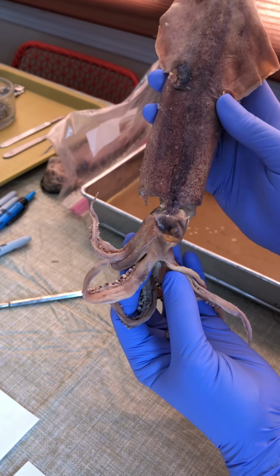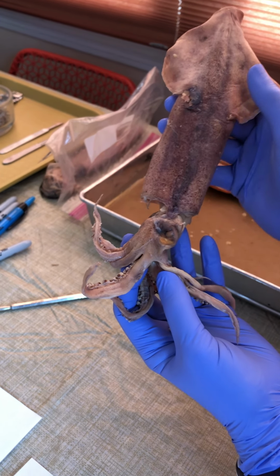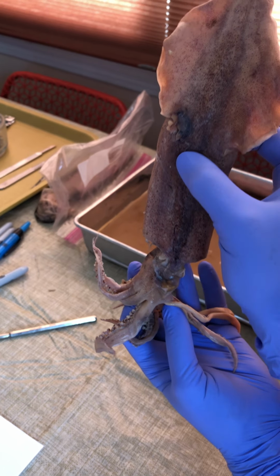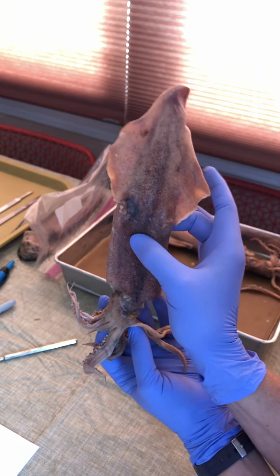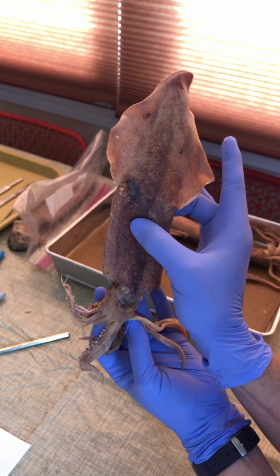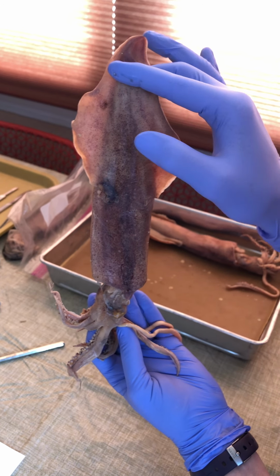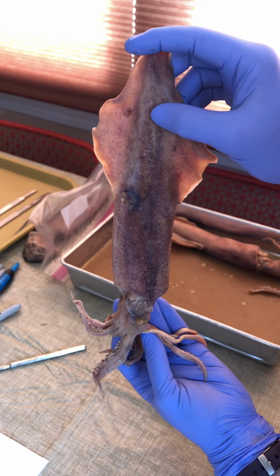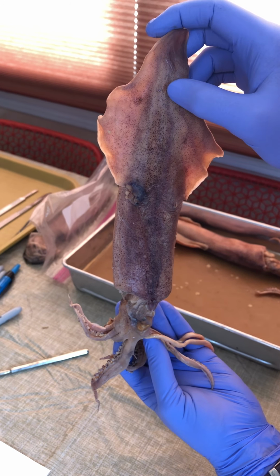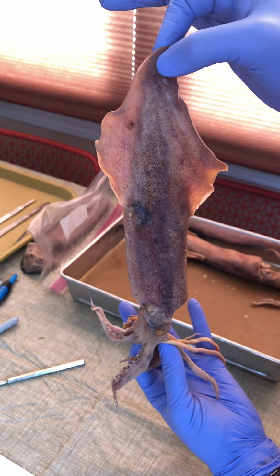And in an animal with bilateral symmetry, the long skinny axis is usually anterior-posterior, but here it's not. Here, anterior-posterior is between my thumb and middle finger. And dorsal and ventral in a bilaterally symmetrical animal is usually like our belly to back. But here, it's between my left hand and my right hand.